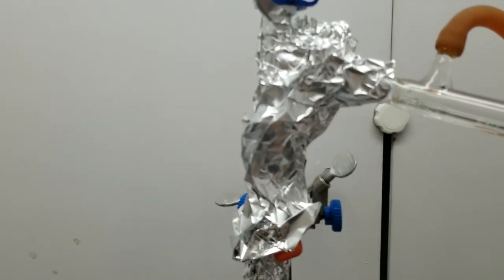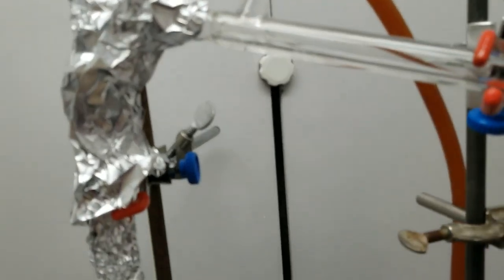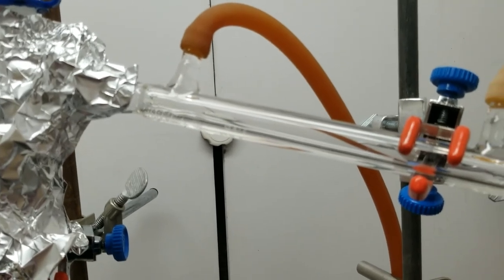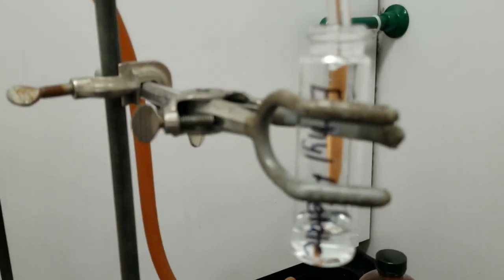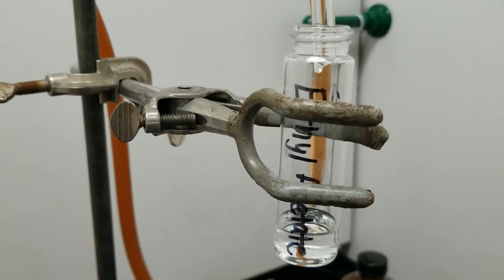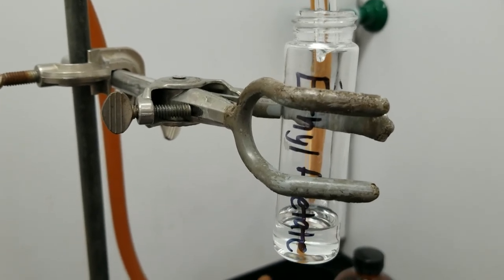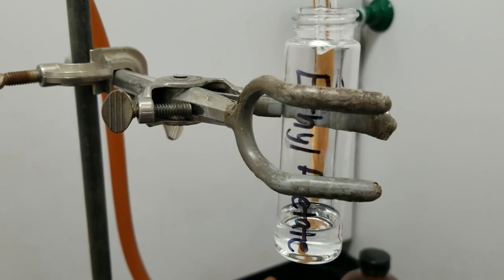So we've got fumes coming across the three-way adapter, which is now covered in aluminum foil. And then we've got water running over our water jacketed condenser, and we've got drips of solvent being collected down here. And so that is an excellent drip rate for right now. So that's how I know that my temperature is good on the distillation.